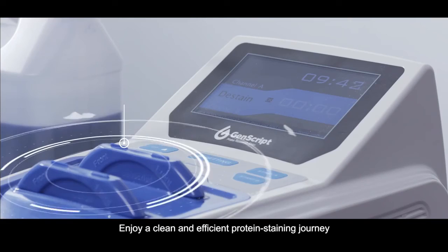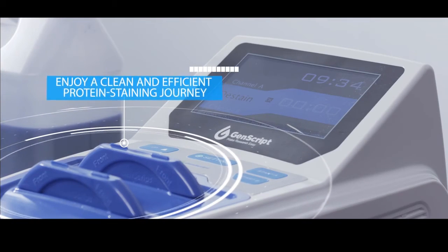Enjoy a clean and efficient protein staining journey. Genscript to make research easy.